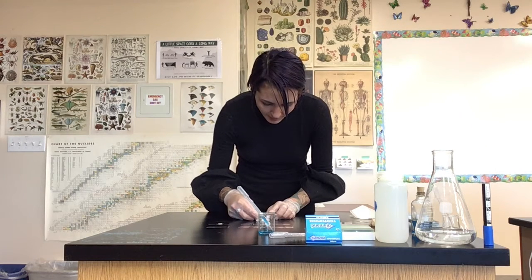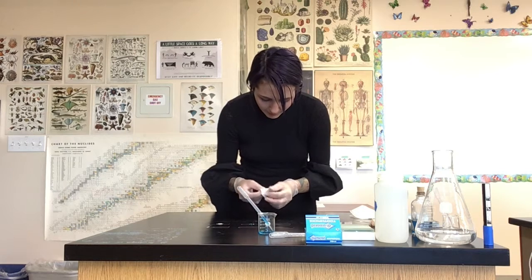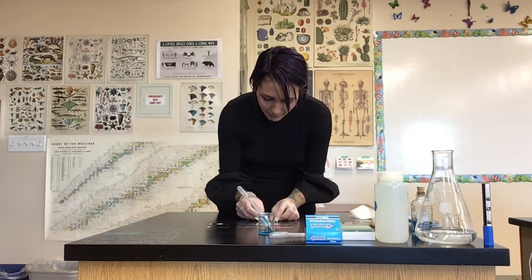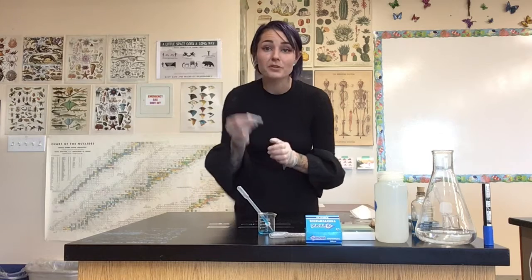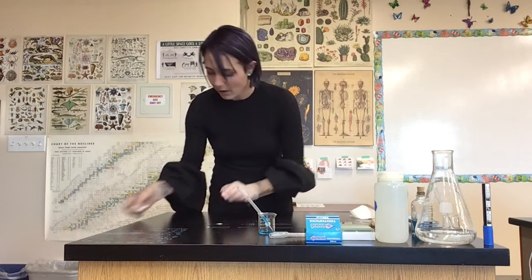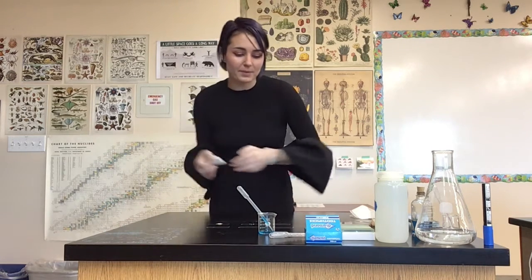So I'm not even going to put the paper towel directly on top of the parts of the roots, just because I don't want them to stick to the paper towel. If we remember properties of water, cohesion and adhesion, if you just put the paper towel close enough, it'll actually soak up all of that water without you having to move it around. It just pulls it all up into the paper towel.